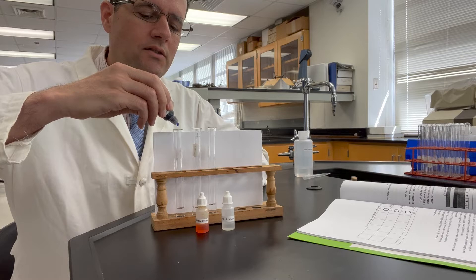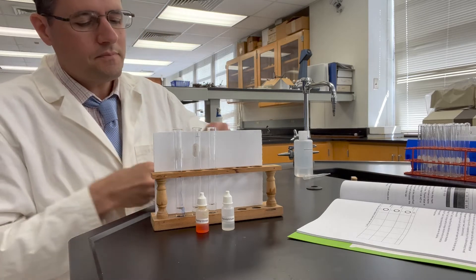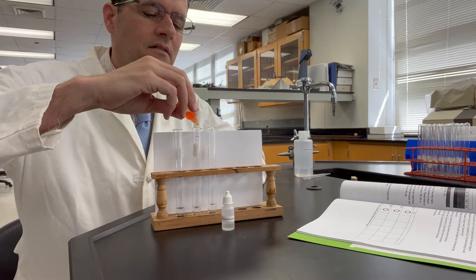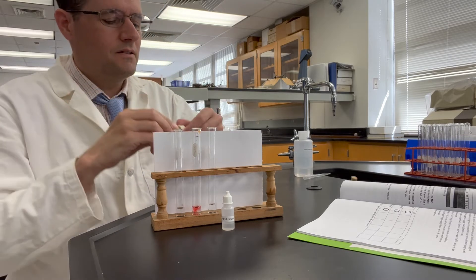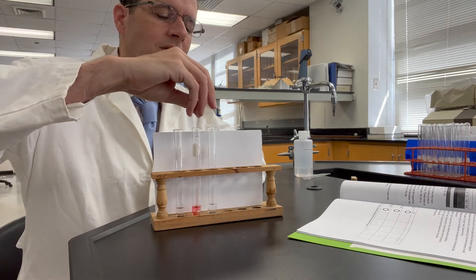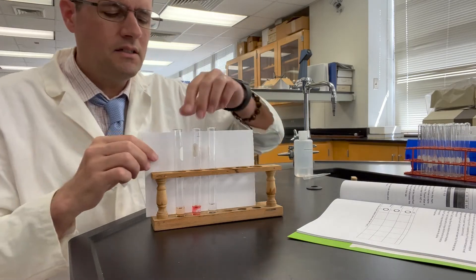We'll add just one drop to each test tube. It's not mixed yet, so give me a second. Okay, let's now look very carefully at the colors.